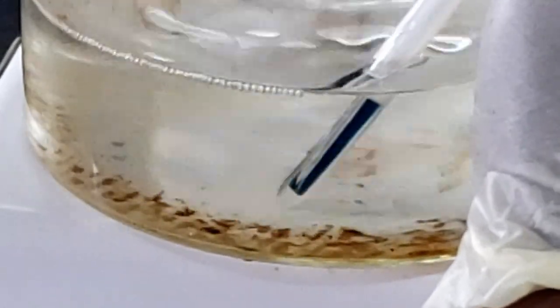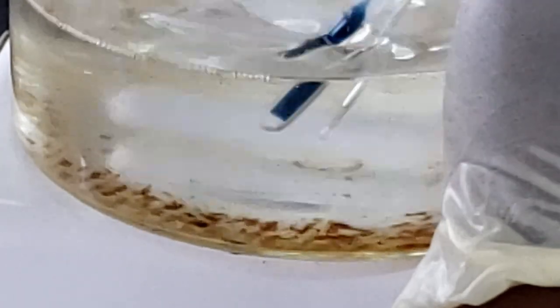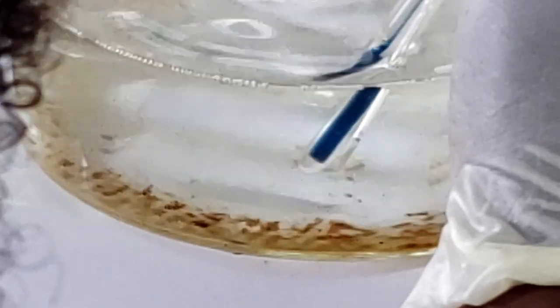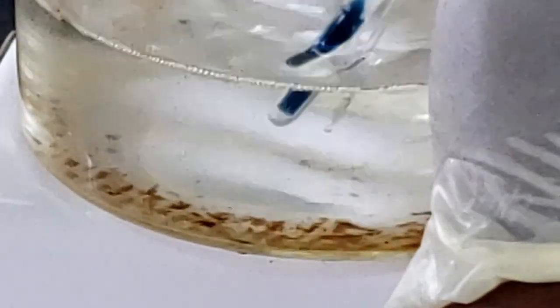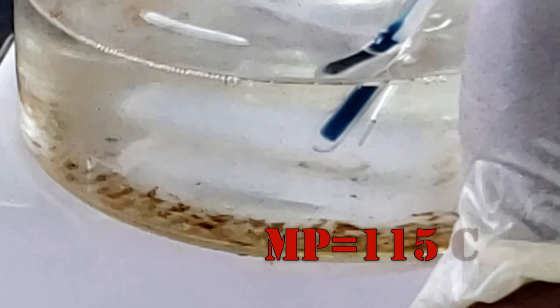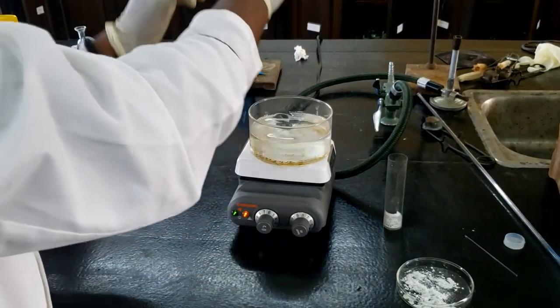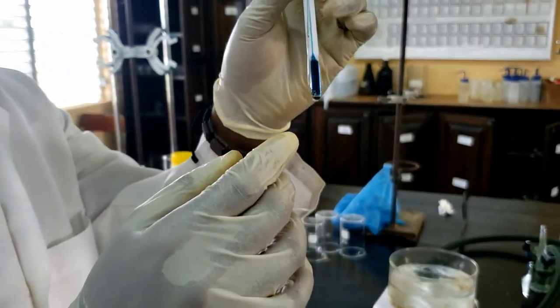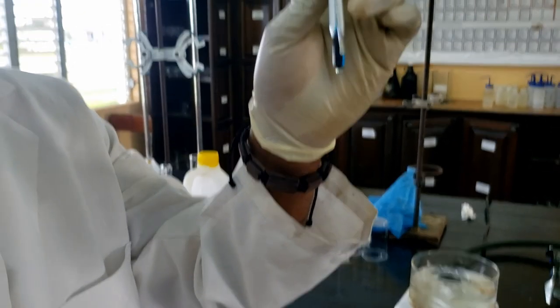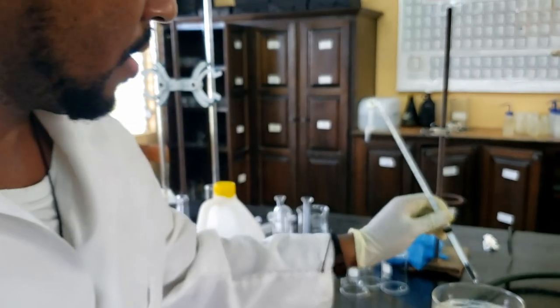Okay, we have some melting occurring, and we're at about 114. Let's make sure everything melts. Yep, 115 degrees Celsius. So at about 115 degrees Celsius, all that crystal melts. So let's move on.